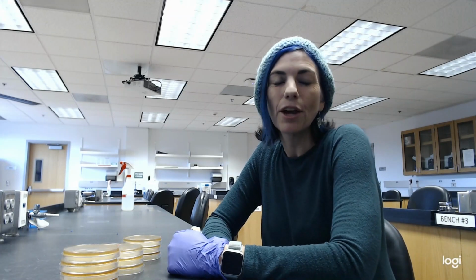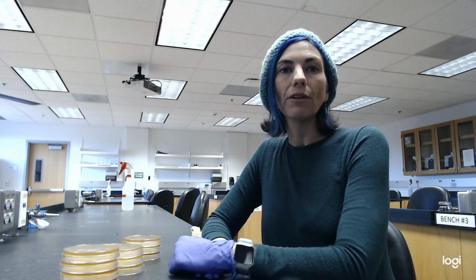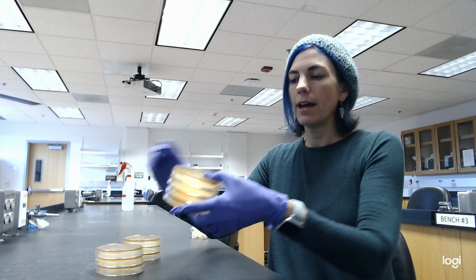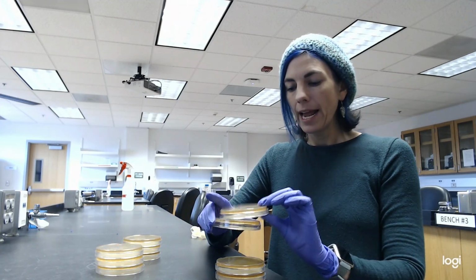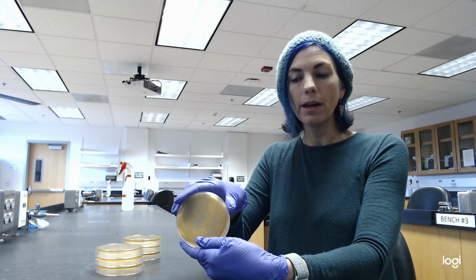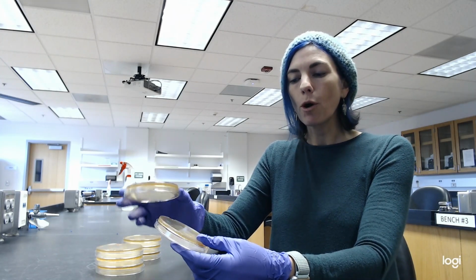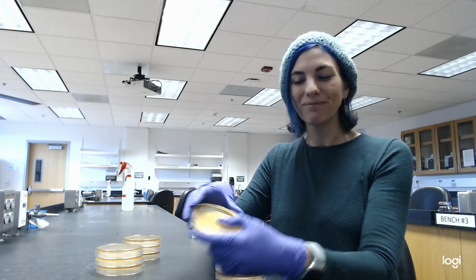Hi, so it's the next day, and we are looking at the results of our pour plates. I have unstacked the pour plates, and I've started to take a look at them. What I'm going to do now is take photos of the pour plates, and I will embed them into this video.